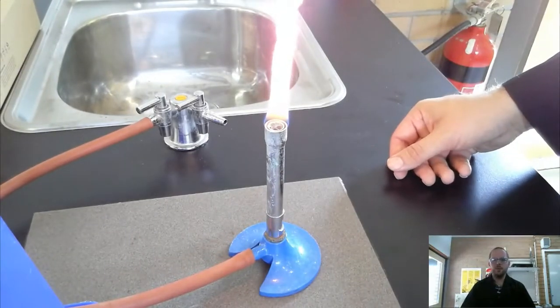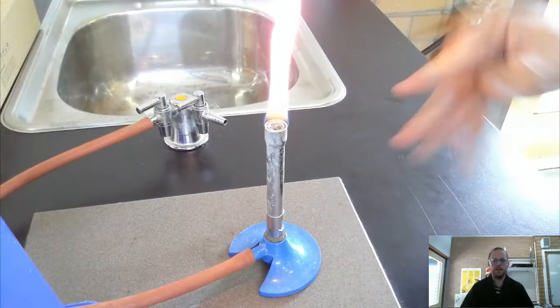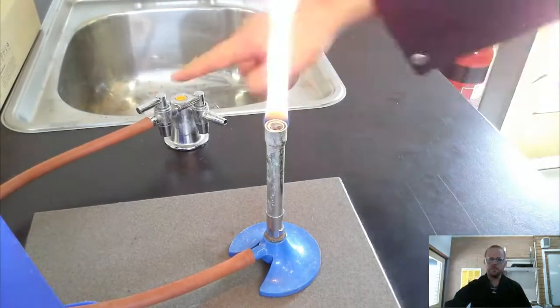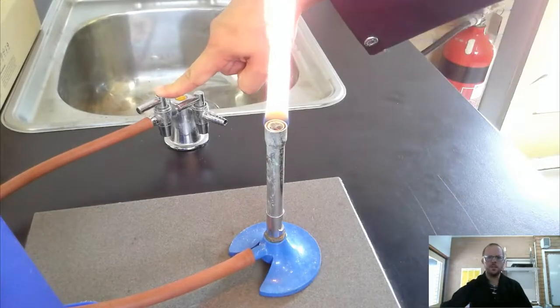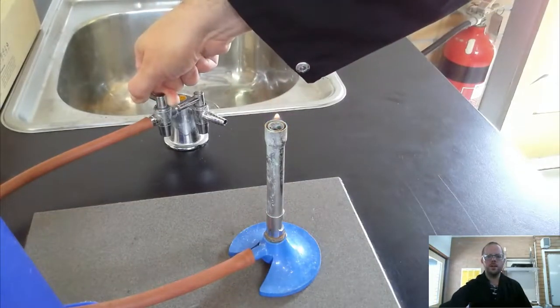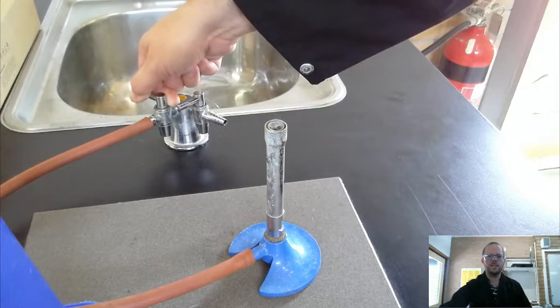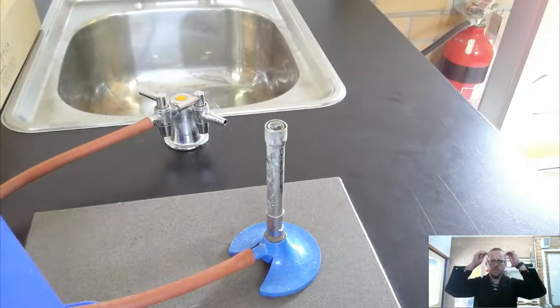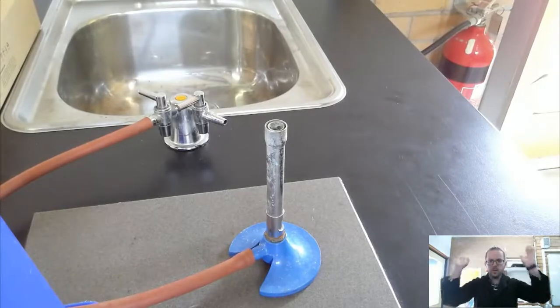And then finally to switch our Bunsen off, I don't snuff out the flame like a candle. You don't ever do that because the gas is still on. Notice my tap is still on. What I have to do is turn the tap off, and you notice that the Bunsen goes out because the gas stops. And now I can take my safety glasses off because I'm finished. Only after you've finished.